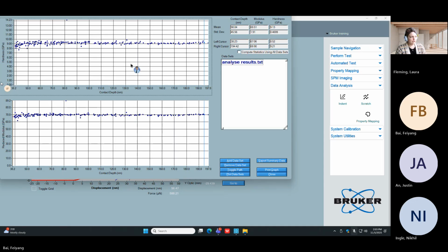So generally, in a mixed use facility, I'd say start checking it at least once every couple weeks, maybe once a month. And you'll figure out what your protocols are as you begin to use the instrument. But it's really hard for me as a service engineer to give you an exact SOP of yes, every 3 months it has to be done. It really depends on what you're doing with the probes.